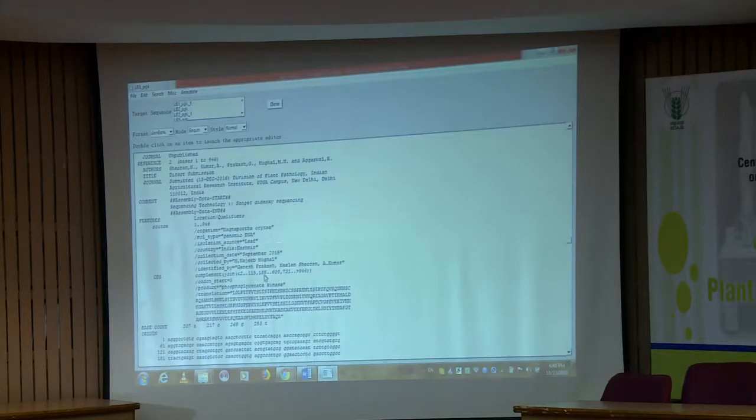Here I specify that if I join the coding sequence from nucleotide number 2 to this, and this to this, that will make the protein sequence, the coding sequence. So, this is the continuity of the coding sequence. In the nucleotide it was fragmented into coding, non-coding, coding, non-coding, but here they want you to specify the coding sequence along with the coordinates, then only they will accept it.